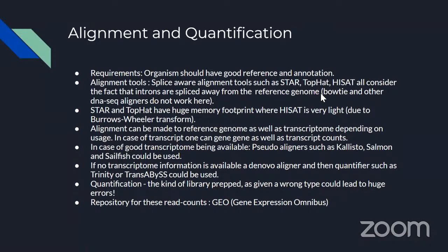Like I said, all these Bowtie and other DNA-seq aligners do not work here. Bowtie, Bowtie2, BWA. These are not what you would want to align with when you're using RNA-seq.